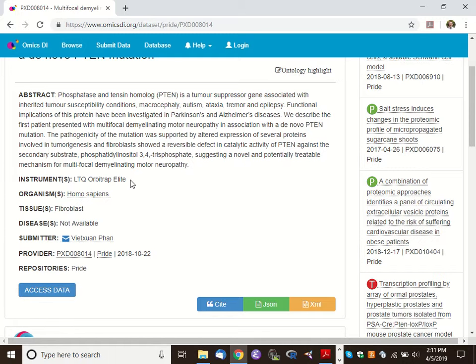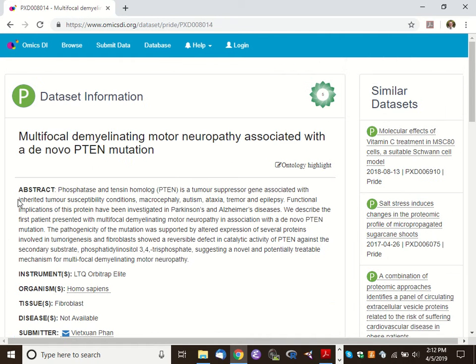But we might want to learn a little bit more about how this experiment actually operated, and for that we could go chasing into access data. For now, I will just specify that if somebody was using an Orbitrap, it's quite likely that this experiment was built around protein identification through LC-MS-MS. So if you see something like Orbitrap or another Thermo-type instrument, it's very frequently the case that it was used for LC-MS-MS. All right, so let us back up one.